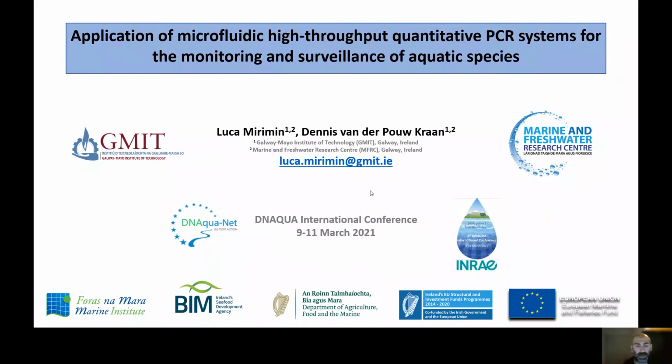I'm Luca Mirimin. I'm a lecturer in aquatic ecology at Galway Mayo Institute of Technology in Ireland. And today I'll be sharing our experience with using a microfluidic high-throughput quantitative PCR system adapted to the monitoring and surveillance of aquatic species.